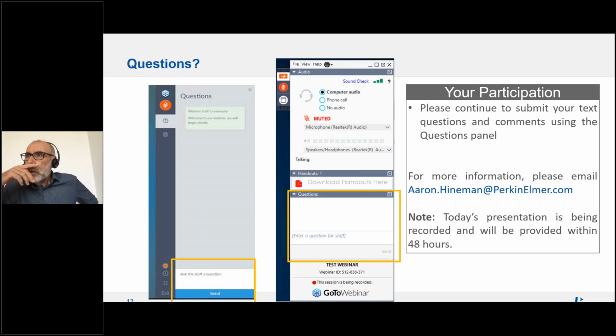the difference with imaging techniques, I would say, is that we can get quantitative information, really quantitative information, with respect to the number concentration that we are not going to get with these imaging techniques. And secondly, I think this is the speed. Normally, single particle ICPMS is a rapid technique.